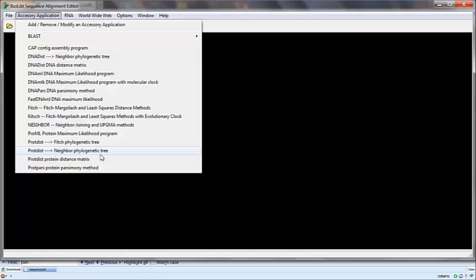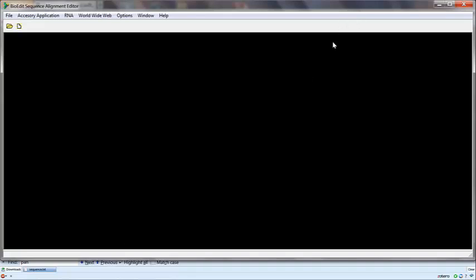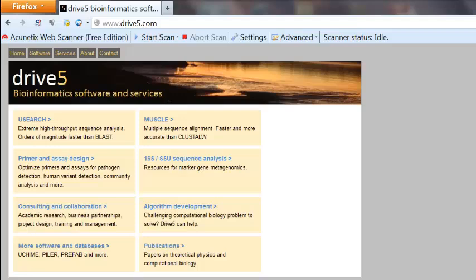Today I'm going to add a sequence alignment program named MUSCLE. It's a pretty good piece of software — much faster than ClustalW — and I often find it does a pretty good alignment between DNA or protein sequences.